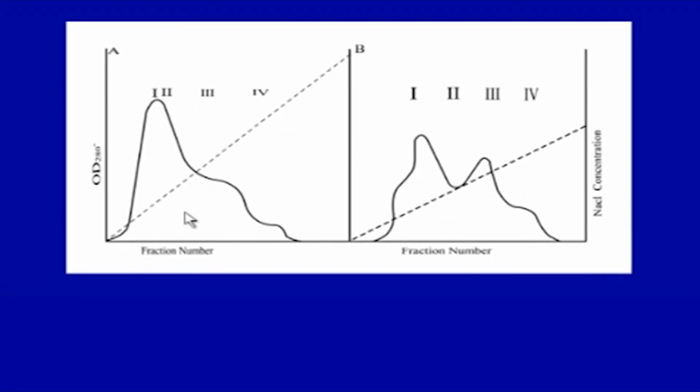Now, if you see here, the chromatographic purification has been compared for a steep gradient and a somewhat less steep gradient. You can see that in the steep gradient only the first peak is very clear, other peaks are not very clear, but here you can see two peaks are separating and other peaks are visible. That is very important.